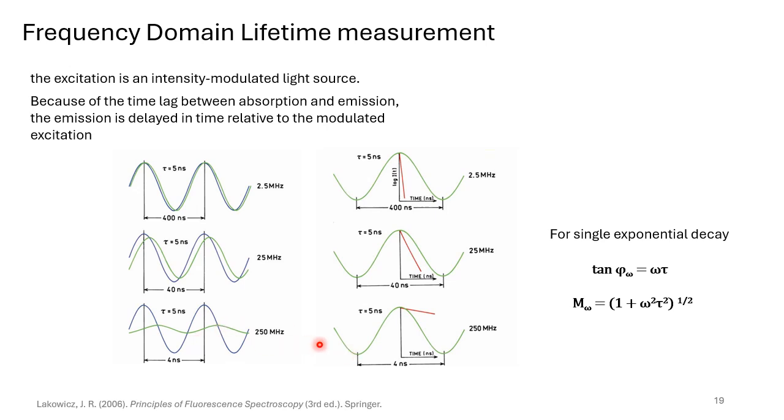So this lagging is easily understood if we compare this, which is the phase, and this, which is of course the time domain calculation, where we show the decay in this logarithm plot. So this can be understood easily, why this lag, or why this difference of amplitudes is occurring, or is observable when we use a higher modulation frequency.